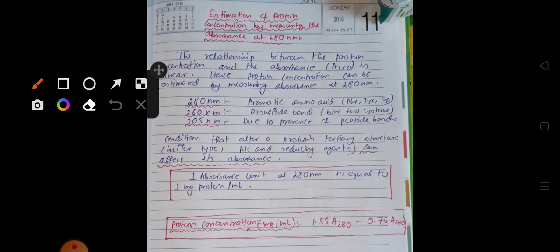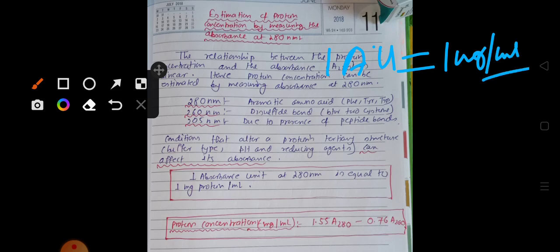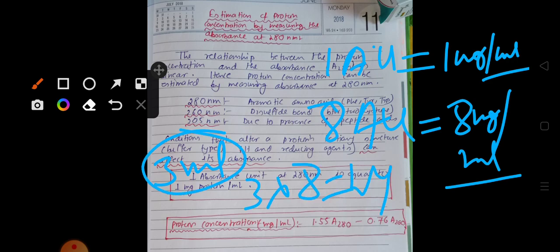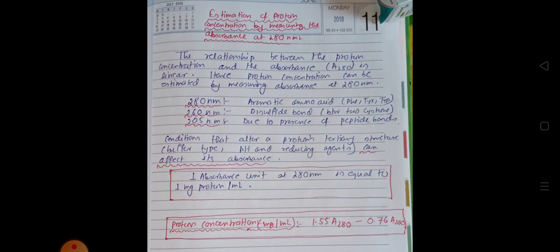Now you know that one absorption unit is equal to 1 milligram per milliliter of protein at 280 nanometer. Suppose you have gotten 8 absorption units, so the concentration of protein in your test tube is 8 milligram per milliliter. Now let's say you have used 3 milliliter solution in the test tube, so 3 times 8, 24 milligram is your amount of protein in that particular test tube, right? So that is how you can measure the protein.